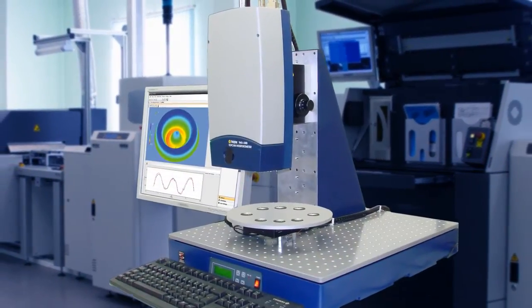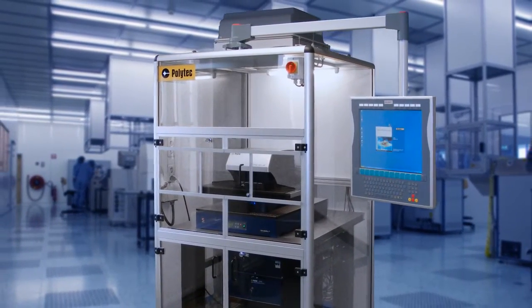Polytech also offers measurement systems and workstations that can be easily integrated for in-line or at-line inspection.